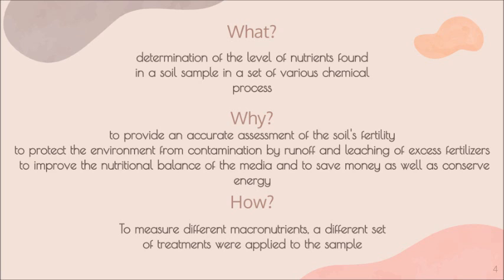So why do we do this soil analysis? There are a lot of reasons why, and here we provide three. The first one is to provide an accurate assessment of the soil's fertility. By doing this soil analysis, we can actually know what the soil contains. Therefore, we can adjust its fertility, or we can know whether the soil is fertile or not. Therefore, we can know whether we need to add fertilizers or not, whether it is suitable for us to plant in that soil or not.